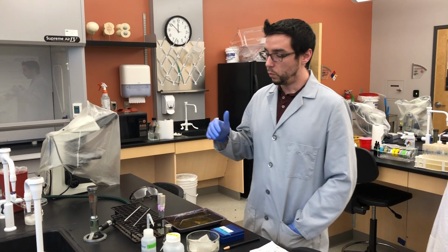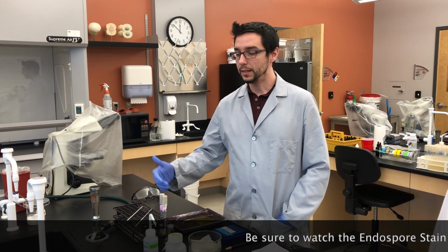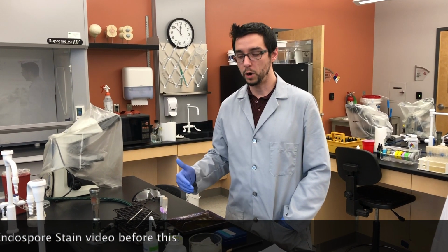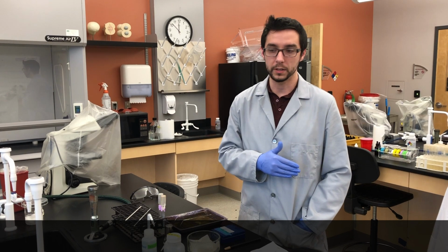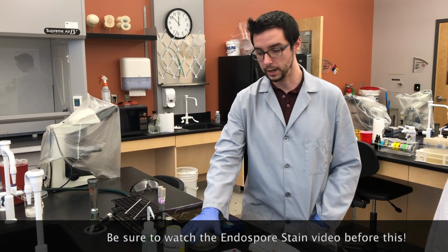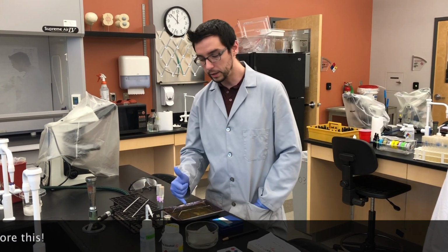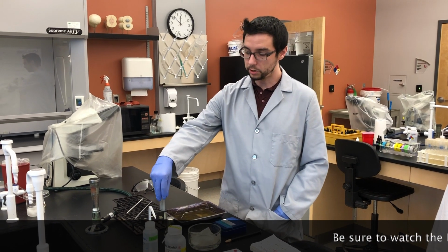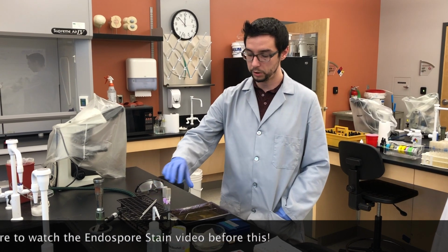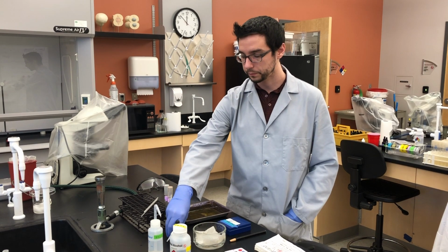So what we're going to be doing is something that is very similar to the endospore stain procedure. A lot of it is the same, so we're simply going to talk through it here for a moment and then show you how to actually perform the stain. We've already prepared everything up to the point of performing the stain. But to get to that stage, remember you need a slide, label it correctly. You're going to have slants that you're drawing your cultures from, and because these are solid cultures, remember you need to prepare your smears using some sterile deionized water.